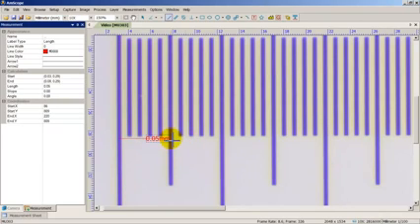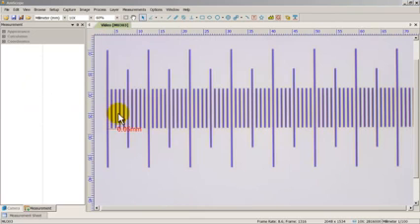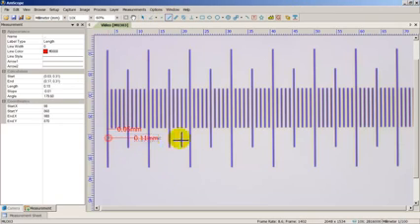Perfect calibration. Didn't make any mistakes on this one at all. Okay, yeah, so there you go. I went ahead and measured that 0.05, and it should be pretty accurate from now on. So let's go ahead and get the line again. And we're going to measure it from this point up to here. And make sure that the line is straight, there are no breaks. And yeah, that is 0.28.